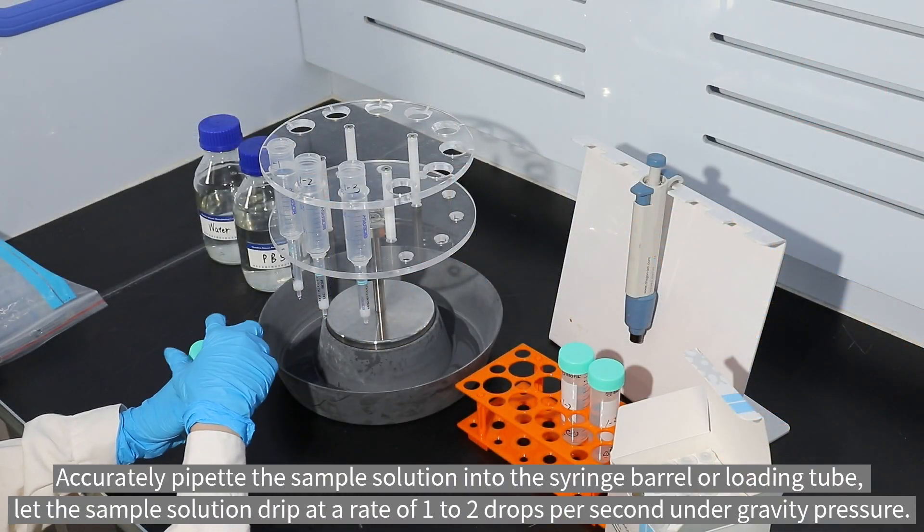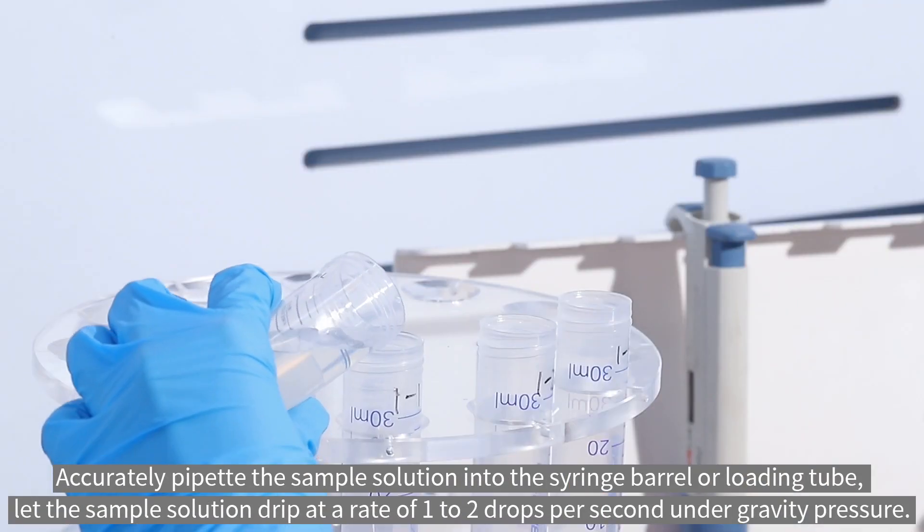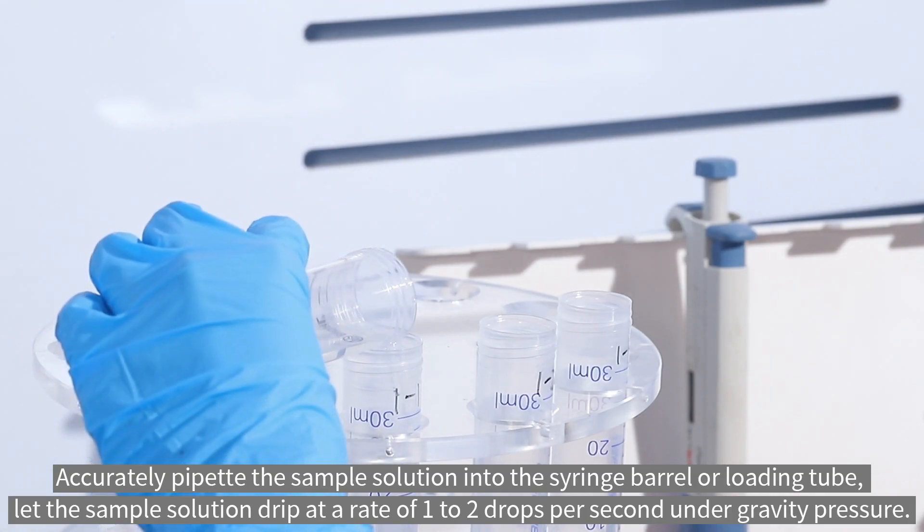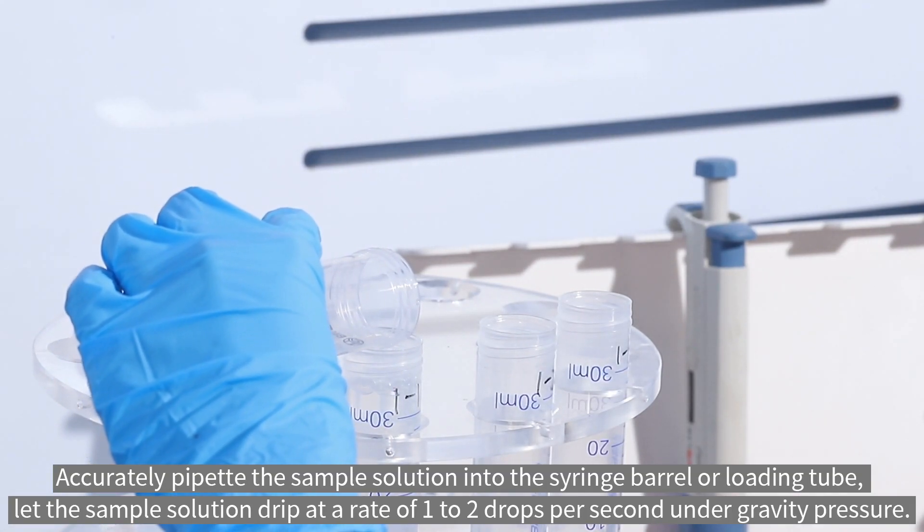Accurately pipette the sample solution into the syringe barrel or loading tube. Let the sample solution drip at a rate of one to two drops per second under gravity pressure.